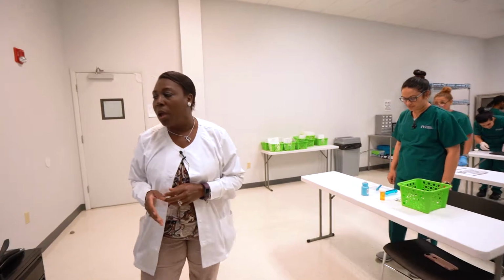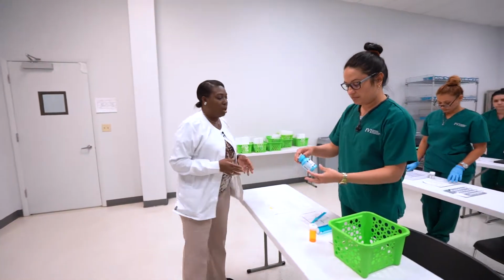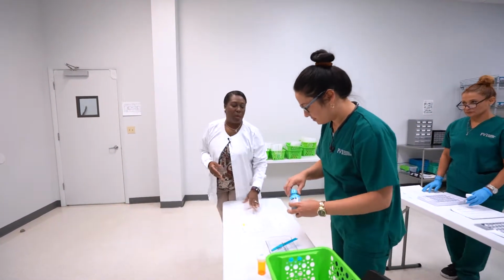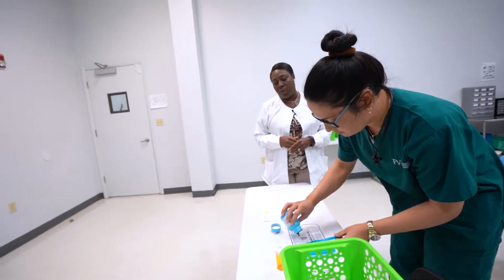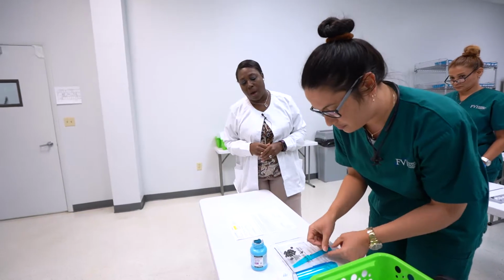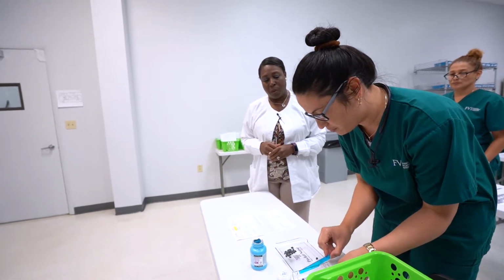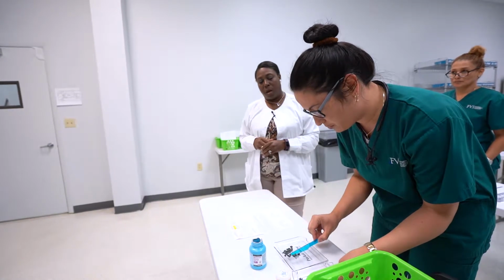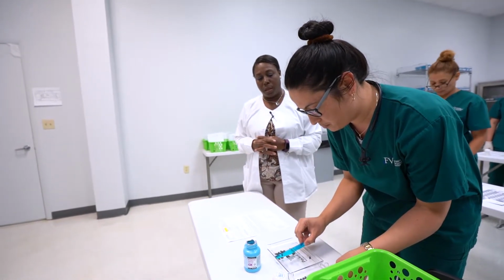Next, after we have entered the prescription, we are going to get a label. Now we have Yelani here. She is counting the medications after we've gotten the label. She's going to put it on the counting tray. And remember, we want to count by fives. So she's counting about 20 pills for this particular prescription.